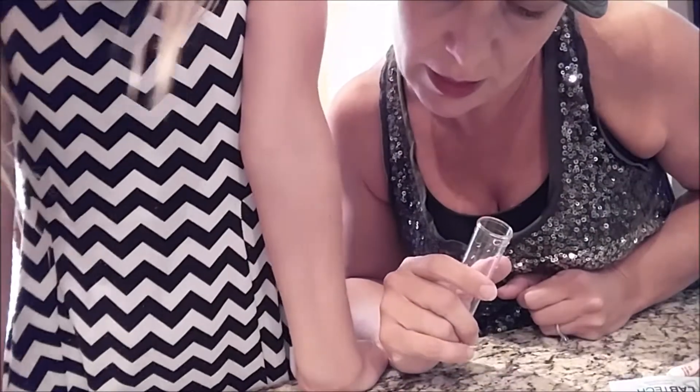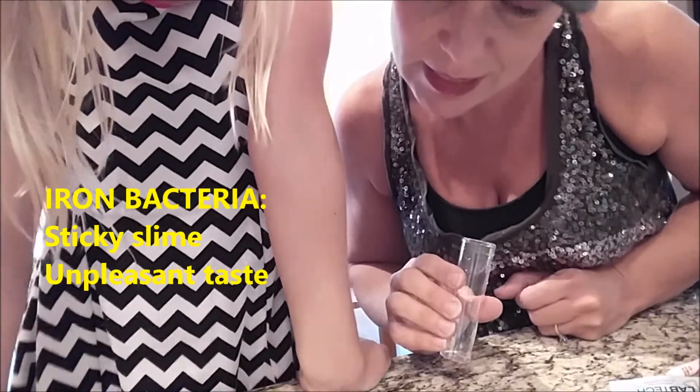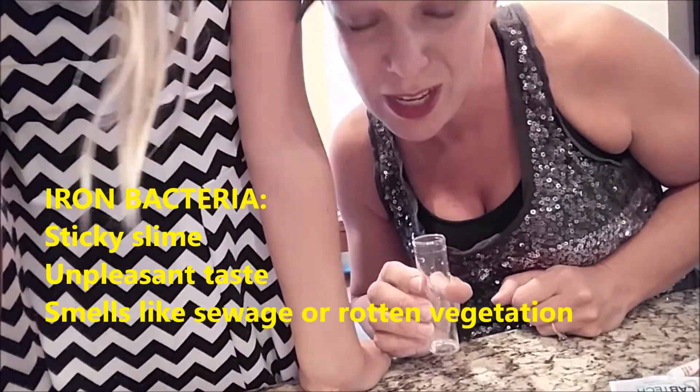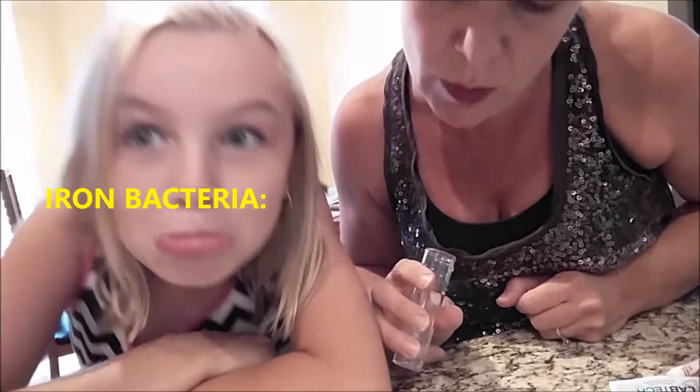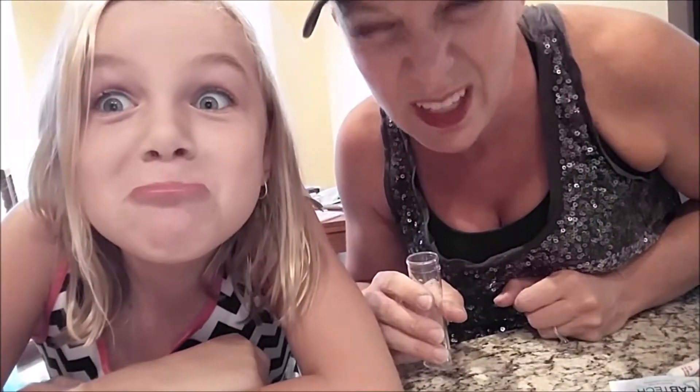Iron bacteria test. Iron bacteria can produce a sticky slime in the water, cause an unpleasant taste, and smell like sewage or rotten vegetation. However, iron bacteria poses no health risk. Now you hear bacteria and you think health risk.